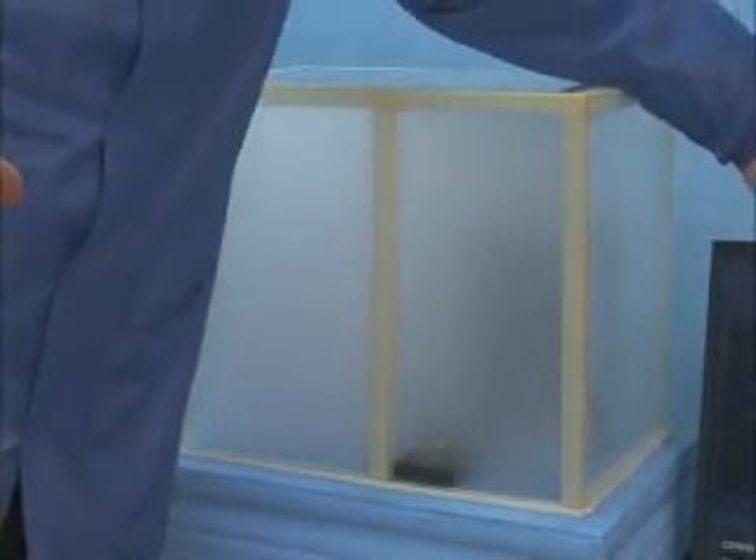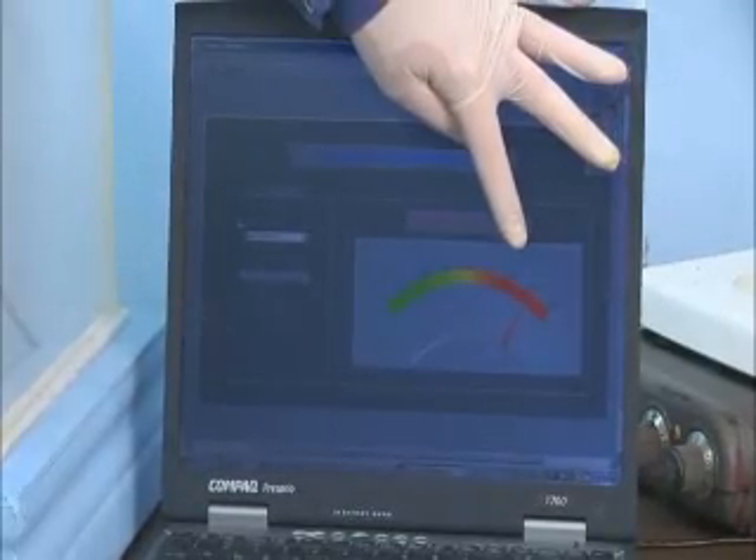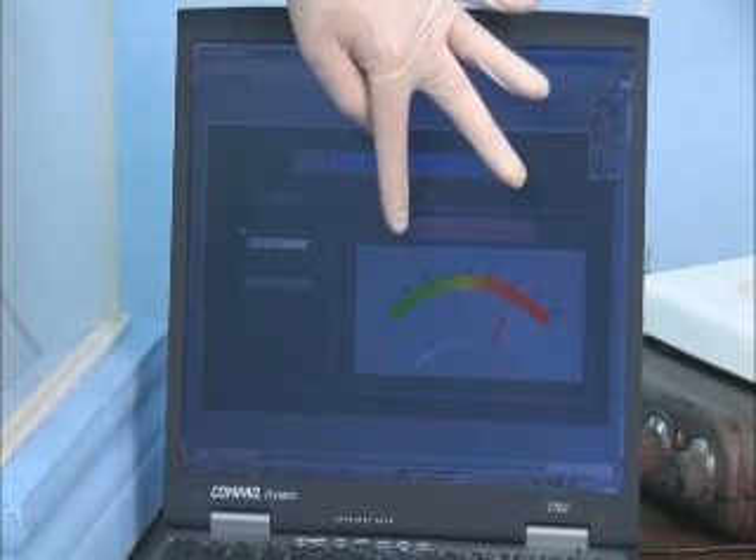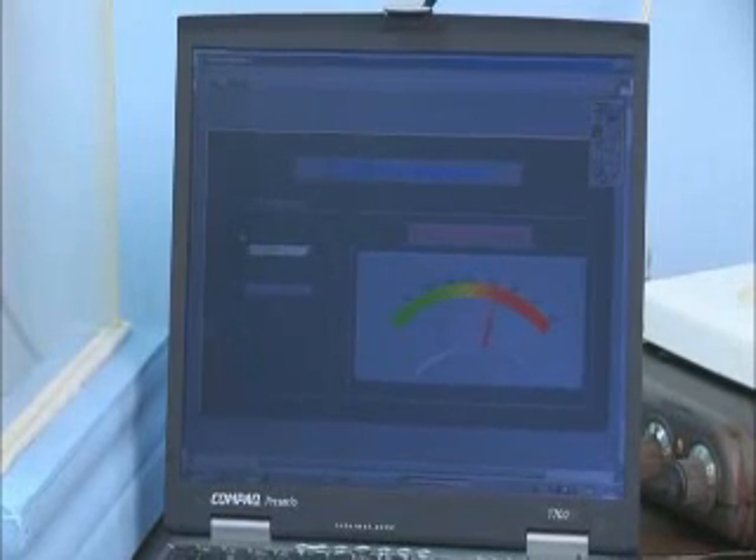Notice on the laptop it is in the red zone. After a few seconds, it will move down to the green zone, showing you that we have cleaned the test chamber with the ChemStop device.